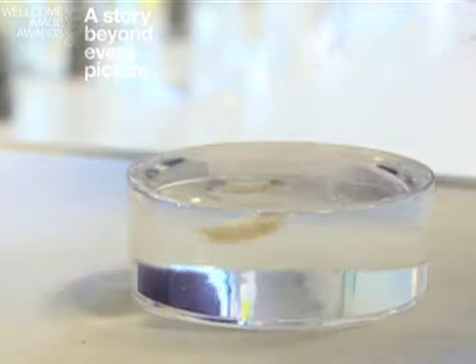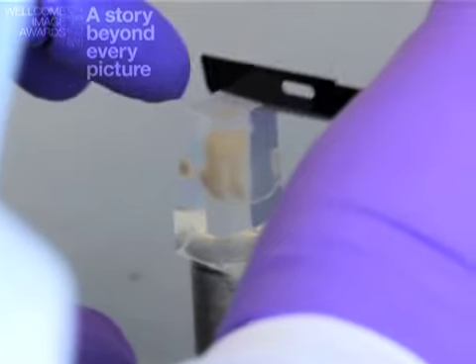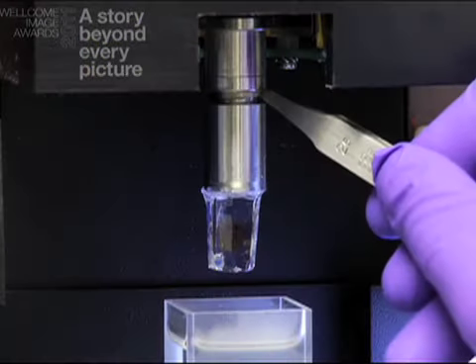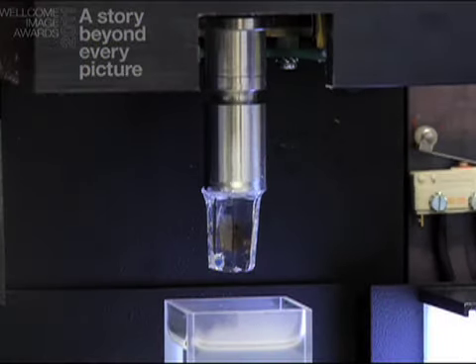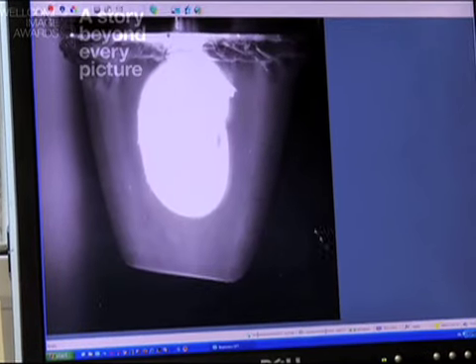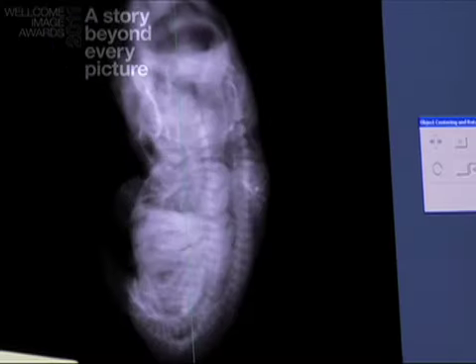First, the embryo was embedded in a gel to stain cells in its organs. Then light was shone through the sample as it was rotated through 360 degrees.